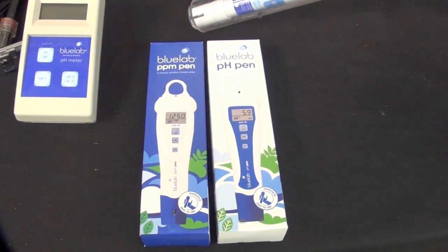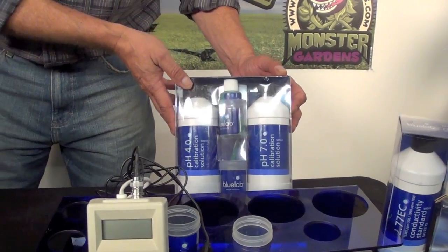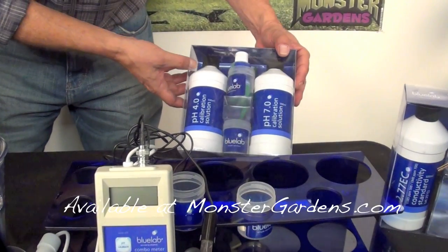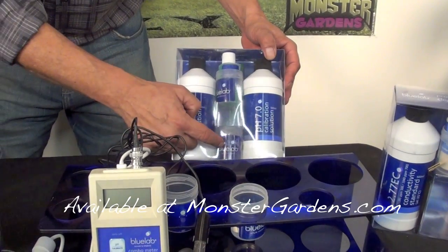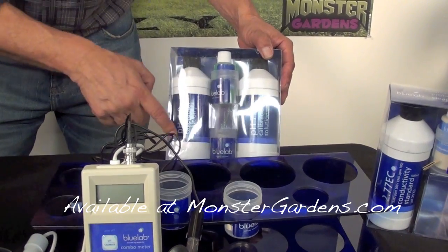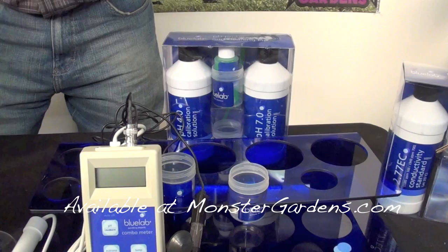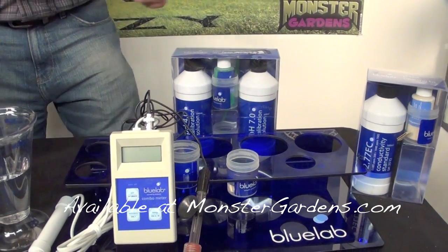We have them available at our store at monstergardens.com. We also have the calibration solutions. If you're going to be calibrating your product and cleaning your pH probe, this is a cleaning solution — there's a soft toothbrush on the inside and a couple of cups. As I showed in the demonstration, you start with your high point, your pH neutral at 7, take it to acidity at 4.0. Once you calibrate, you're ready to go. Do it once every 30 uses or when you change the adapter.